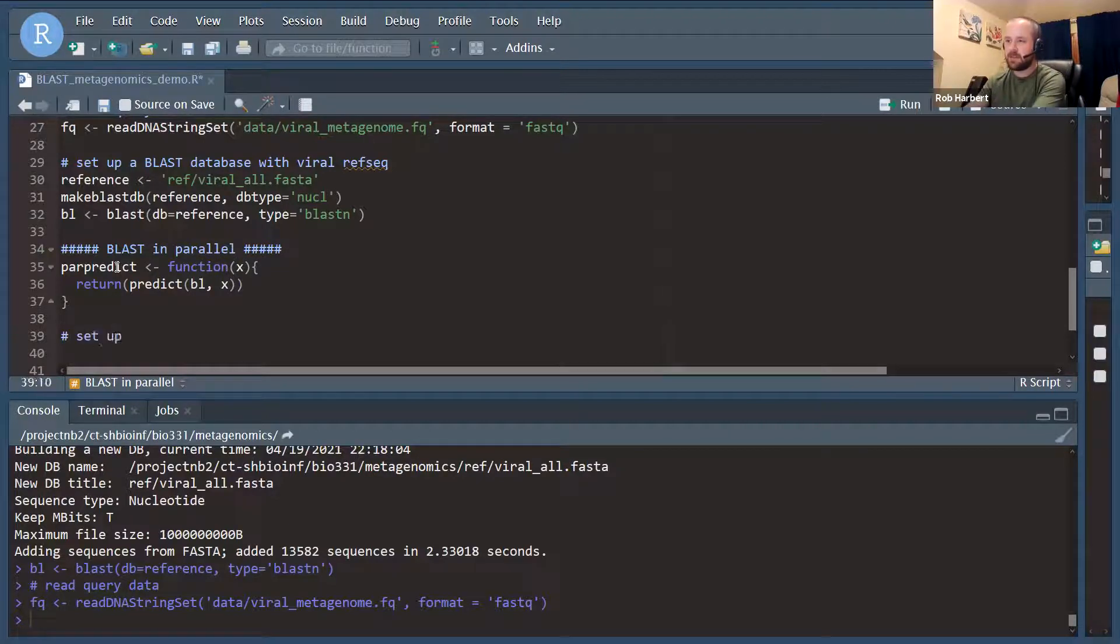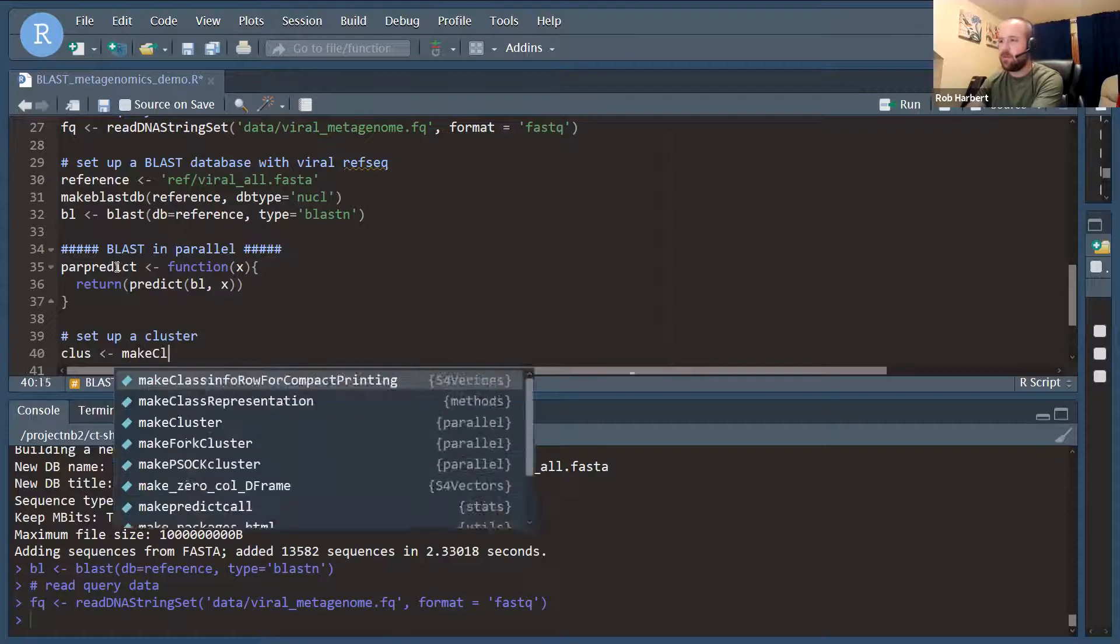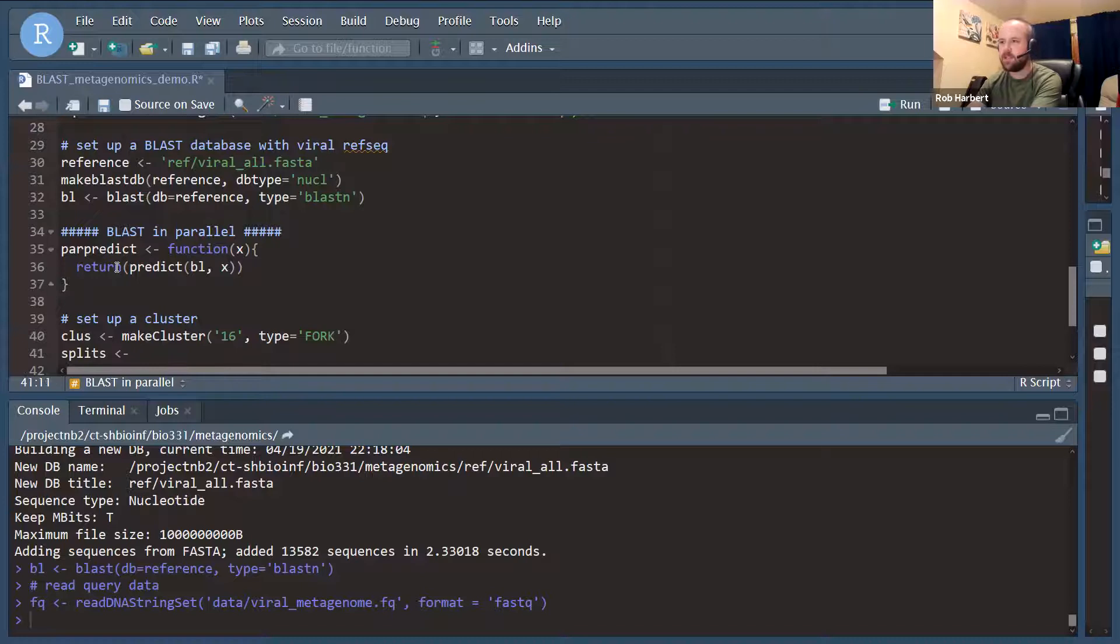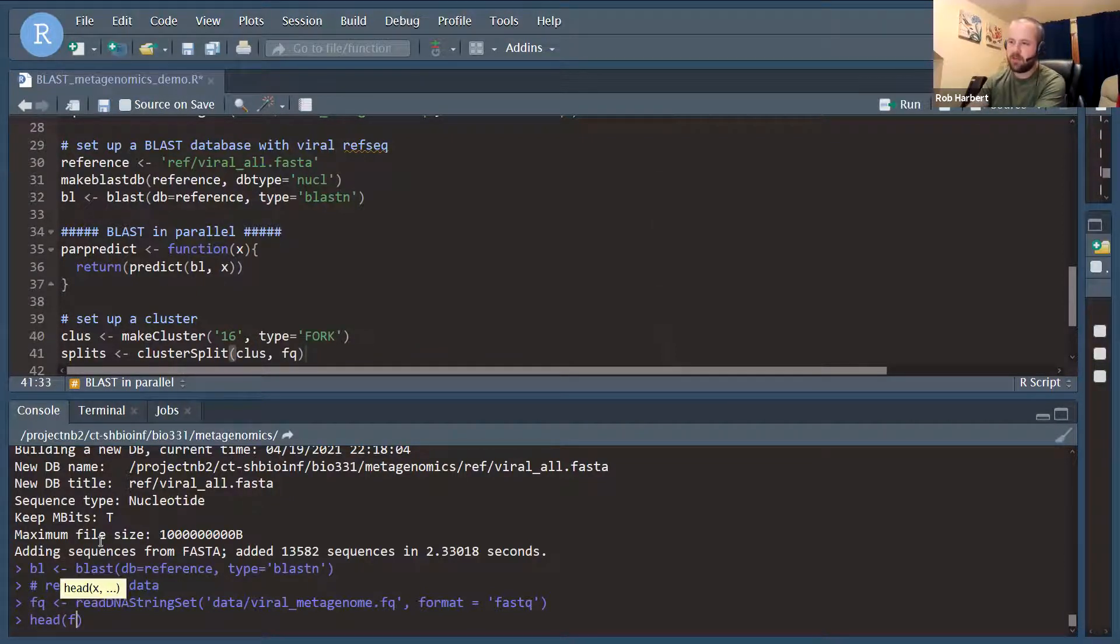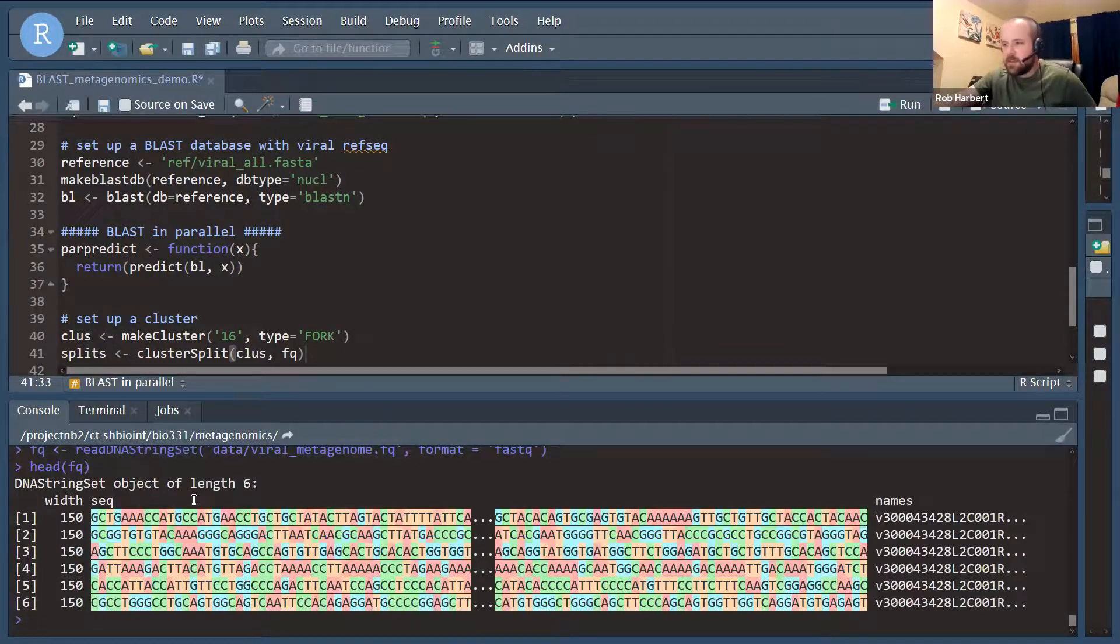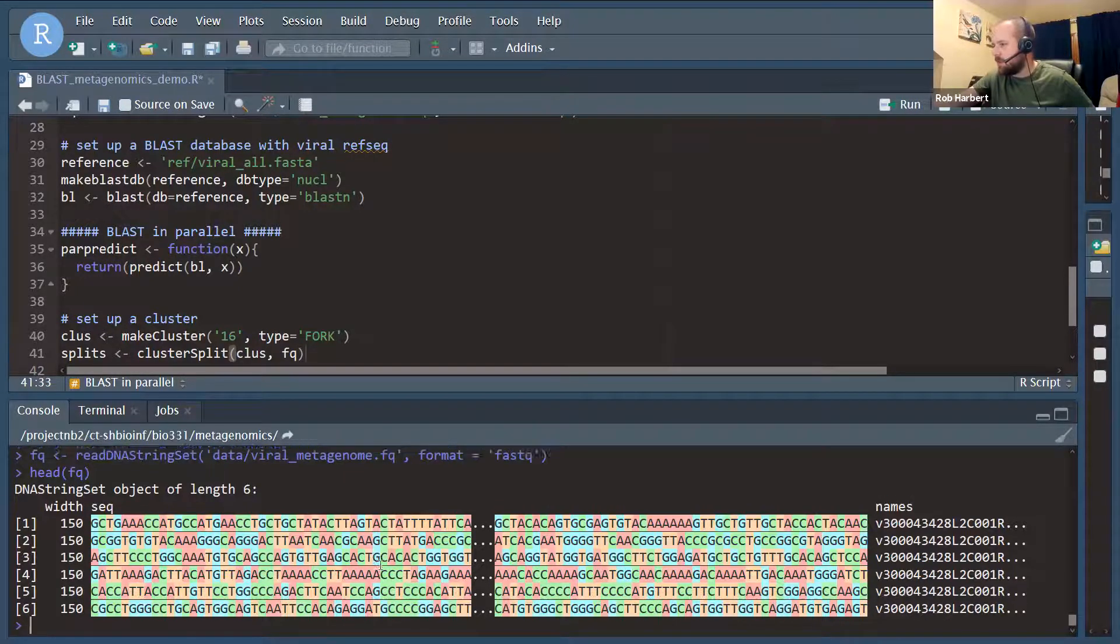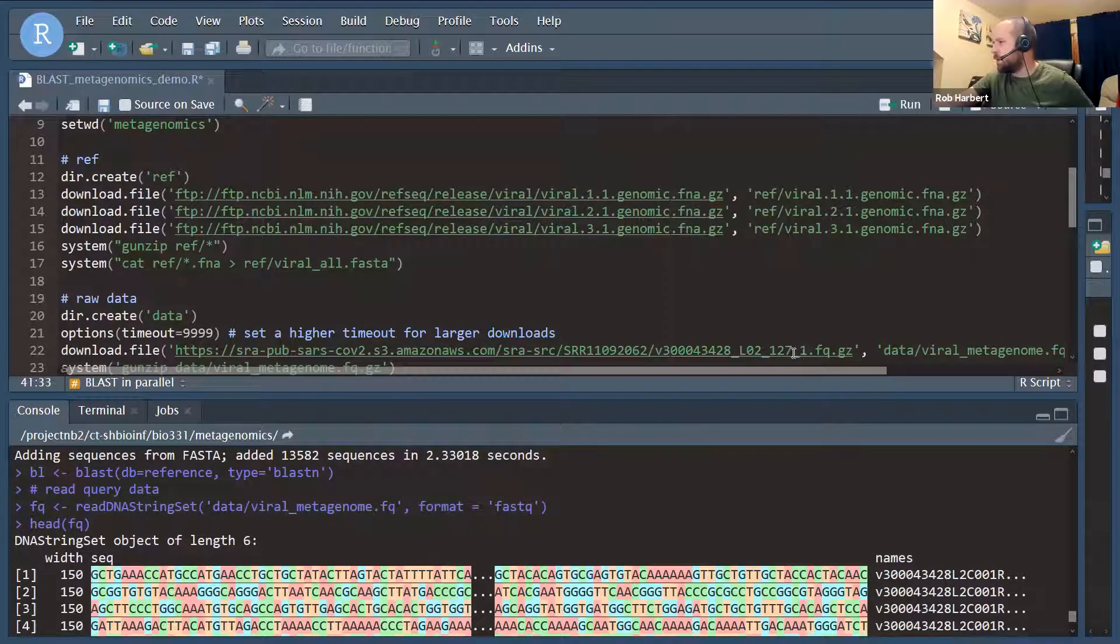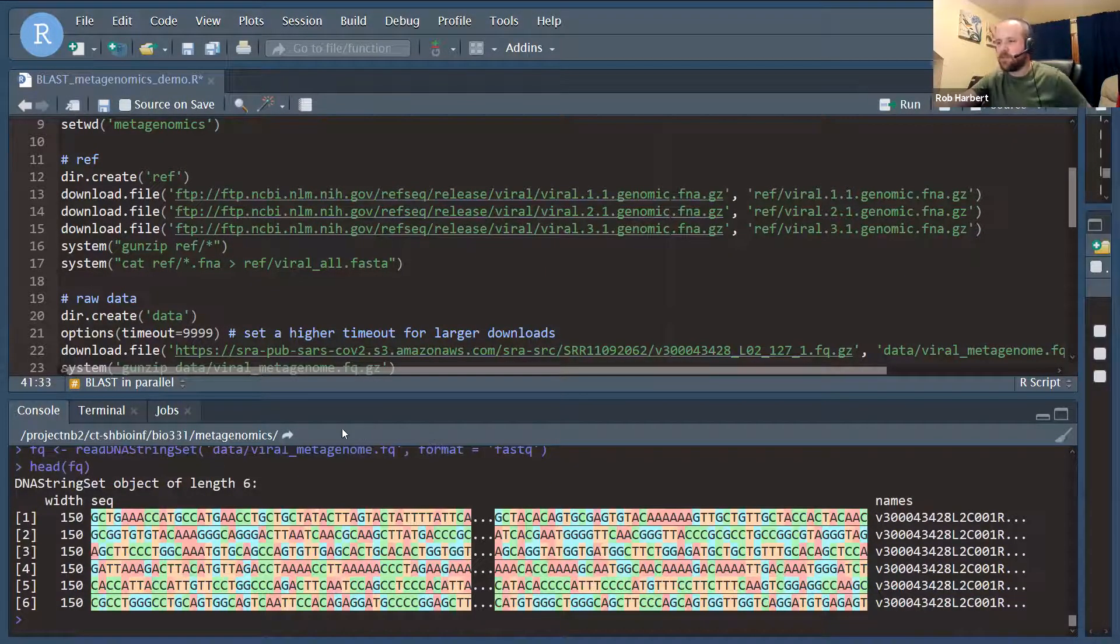Now we need to set up the cluster. This is just going to fork the R process that we're in to make some number of daughter processes. Here I'm going to use 16, but you should use what is appropriate for your system. This is not the most memory efficient parallelization, but it is effective. Next, we're going to use cluster split to split the FQ object. Let's take a look at that. It's a DNA string set object, which is what we want for the BLAST searches, and we have a bunch of 150 base pair data. This is just the forward reads, underscore one FQ from one of our samples. It's just a small fraction of our data. And let's see, 26 million reads in this data set.